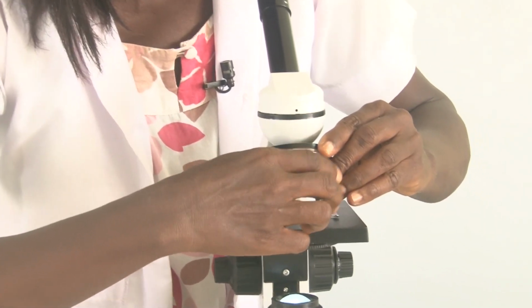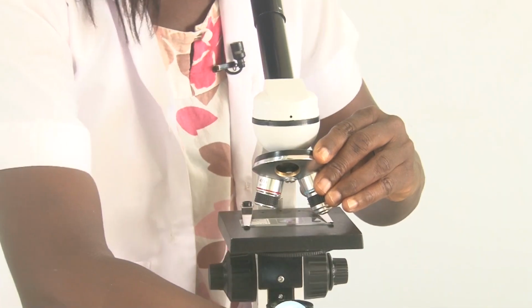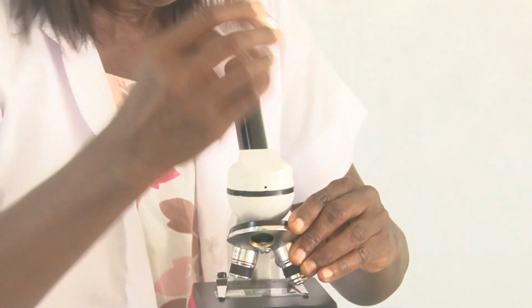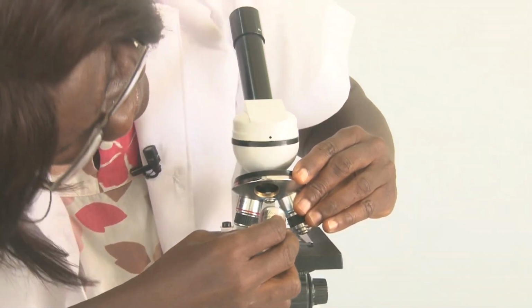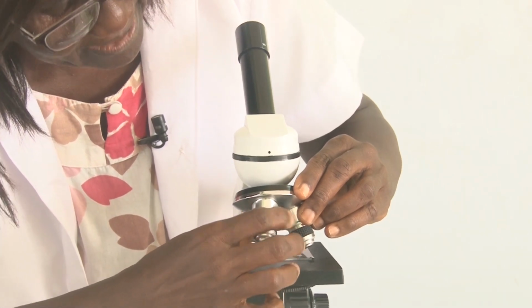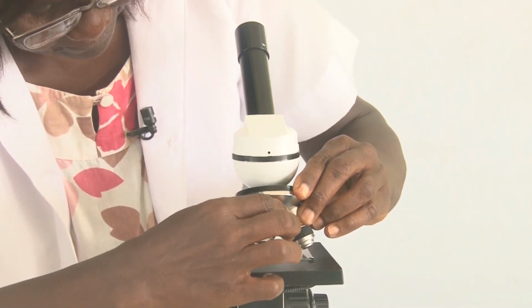Take it off and fix in its place the oil immersion objective lens. So this is the oil immersion objective lens. Fix.